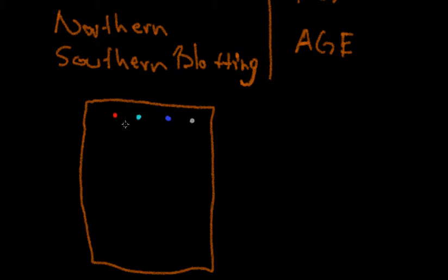So we will put our unknown in well number 1. And then maybe if I'm comparing my keratin molecules to those of my students, this would be me. So I'm going to put a male symbol here. And if we're comparing to my student, this will be a female because she's female. All right, and if we're looking at across species, maybe this is the unknown, and this is human, or this is a known sample of human, and this is rat, and this is dog.